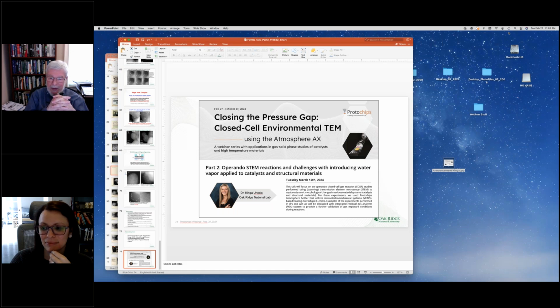So I think they're very good. I would love to have an image corrected microscope that would allow me to do in situ bright field imaging to do some kind of catalyst studies on, for example, samples in that kind of imaging mode.